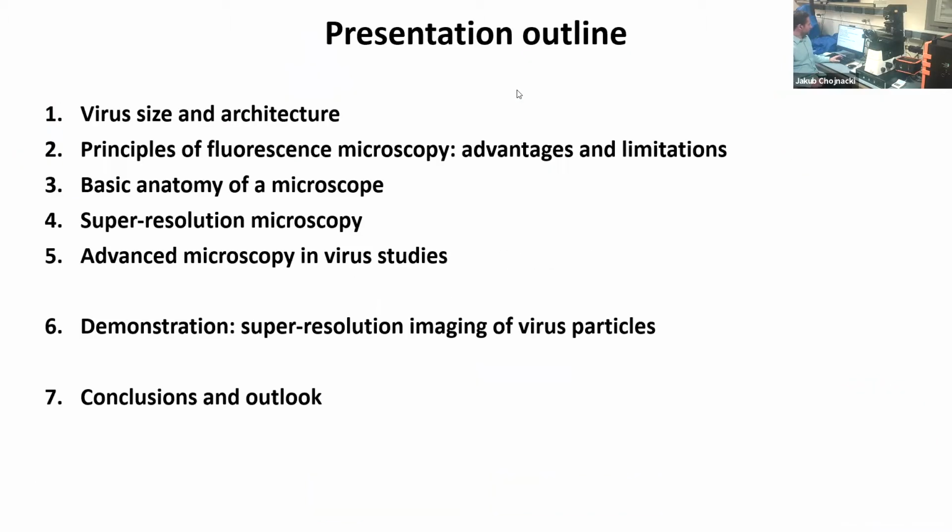In the first part of the presentation, I'm going to give you a bit of an overview on virus size and architecture, and then I'm going to talk a little bit about the principles of microscopy. Then we're going to go for a bit of a basic anatomy of the microscope.